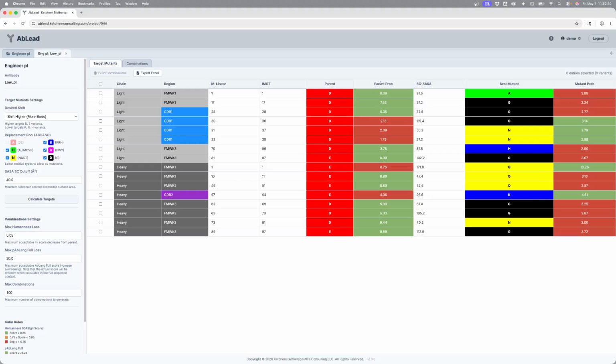The tool shows what the AbLang probability is for that residue. And a few of these have violations. The tool is saying that it should be mutated to a different residue, but they're also in CDR positions. Now, if I were doing this in reality, I would be doing it with a structure, and I would be looking at core fold, possible antigen interaction, not just CDR regions. But for the sake of this demo, I'll just exclude CDR positions, pretending that that's what would interact with antigen.